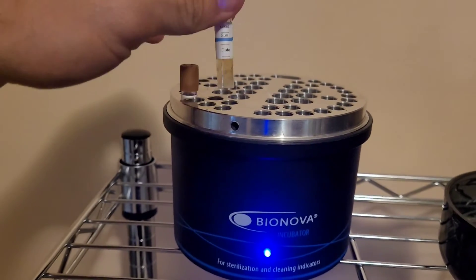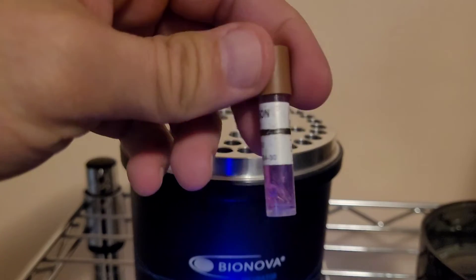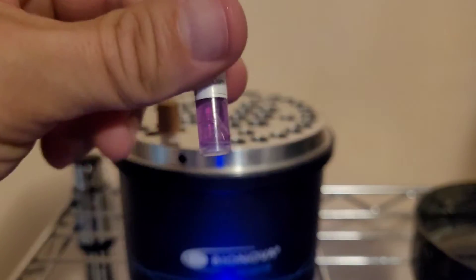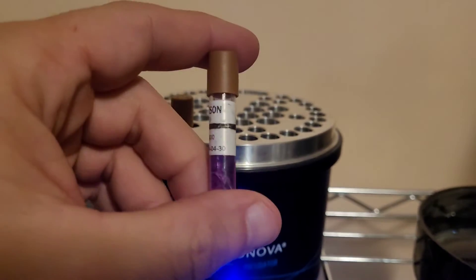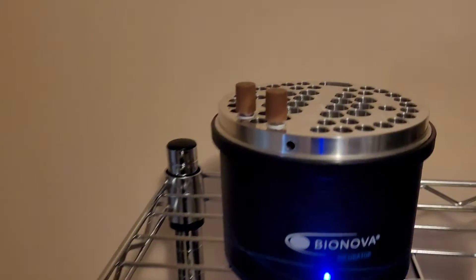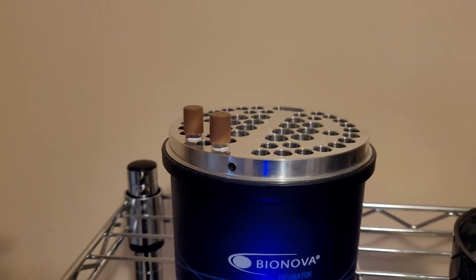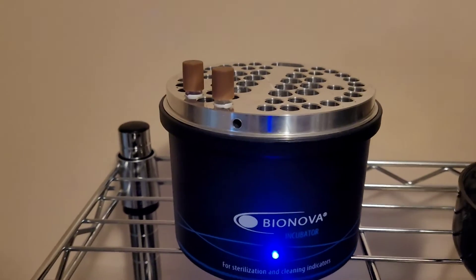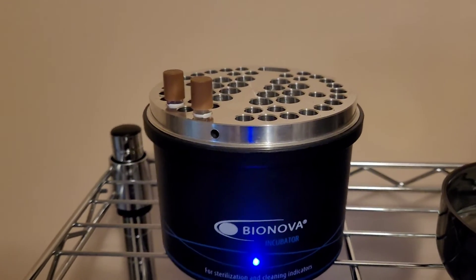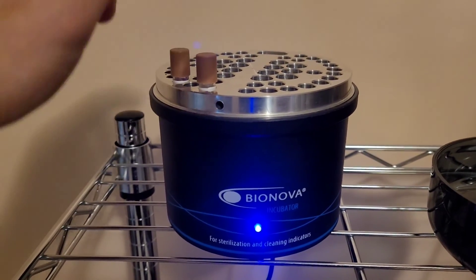24 hours is up for the Instant Pot 90-minute cycle. There's the control — as always, to be expected. And that is the cycled sample, and it is crystal clear. So 90 minutes in an Instant Pot where the max pressure is 9.4 to 12.3 PSI — that's impressive. It's a testament to the efficiency of steam sterilization to kill microorganisms. Not only has the Instant Pot been validated as an autoclave, but both cycles — both the 3-hour and the 90-minute — have been verified. Surprises all around.